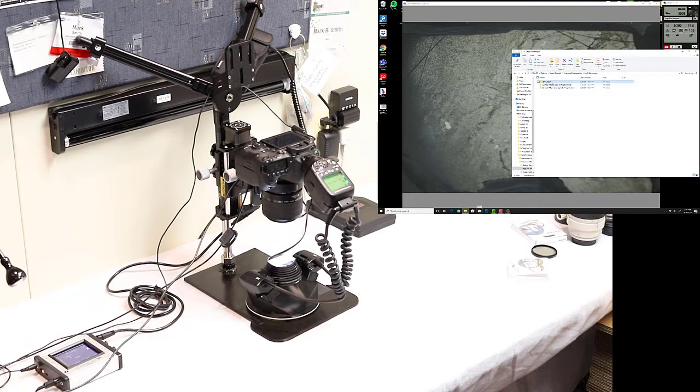Now one thing that's really, really nice about this approach is that unlike a petrographic microscope, this allows us to capture the entire slide in context. That way, if you're a structural geologist and orientation is very important, now you have the ability to preserve that orientation while capturing a high quality photo of the entire slide. And if there are features you need to enlarge, then that's when we'll increase magnification and zero in on those features later. And that's what we're going to do in a few moments.